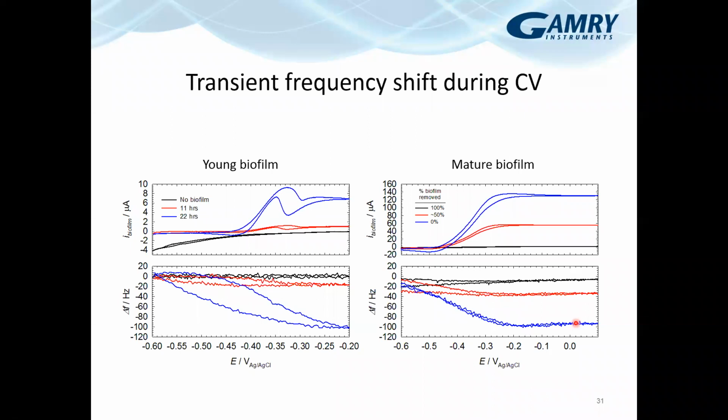If it's an optical sensor, or if it's a microscope, you can actually get ITO coated crystals that are transparent. And so you can couple maybe fluorescence measurements in addition to the EQCM. Obviously, you can't use the Absorption Probe, and you'd have to go into some kind of specialized optical flow cell, but it is doable. And then at that point, you can look at fluorescent changes as a function of oxidation state, as well as look at what that mass change correlates to.